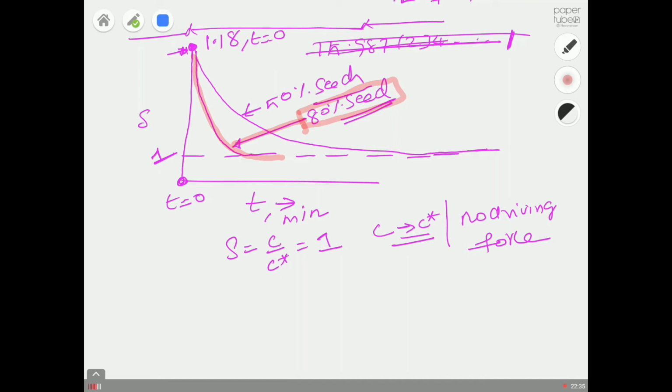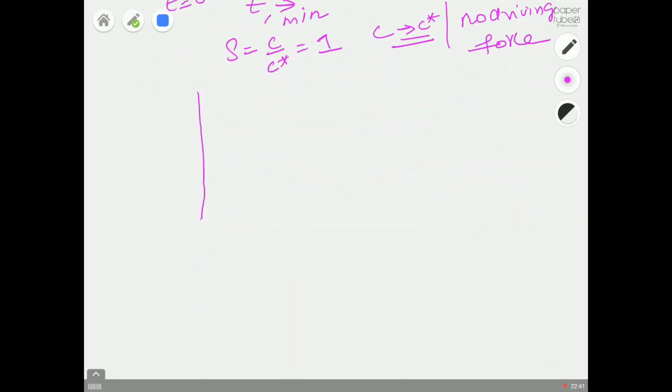And then I asked you to include, in the final report, another graph, which is delta C. That is the mass that you can crystallize, in this case grams of paracetamol per 750 ml of IPA, versus time.